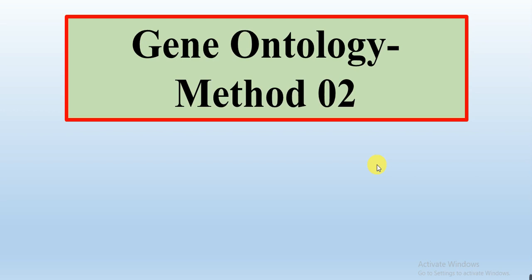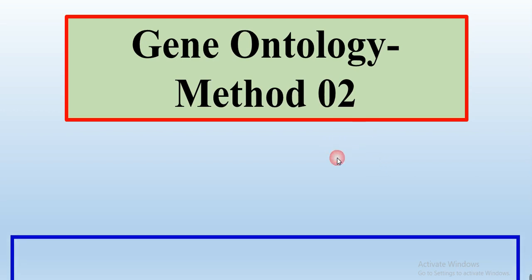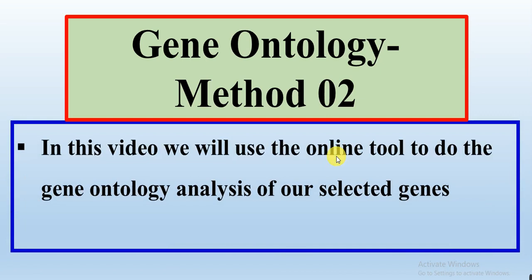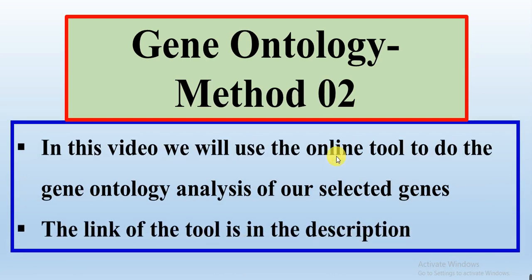In method one, we have also done gene ontology analysis through TBtools, but in this video or in this method, we will use an online tool to do the gene ontology analysis of our selected genes.